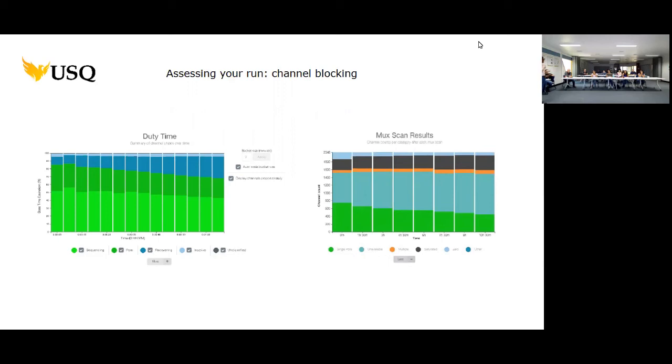The reason a pore will try to recover itself is because it's blocked by something. There are lots of contaminants that will get in here and just block those nanopores up, and they won't be available for sequencing. So they recognise that they're blocked with something. What it will do is reverse the electrical current. It's really clever. It reverses that electrical current and tries to push it back out. So instead of continually trying to drag something through that's blocking it, it reverses the current and tries to push it back out. If it's successful, it will recognise that, turn the current back the other way, start drawing it back in, and it will go back to an active channel in green and wait for some DNA to turn up.